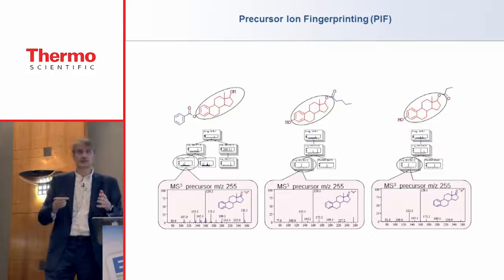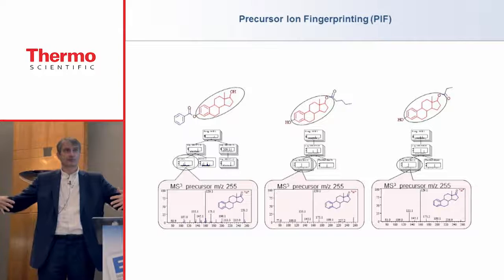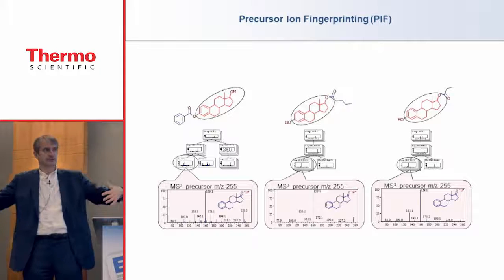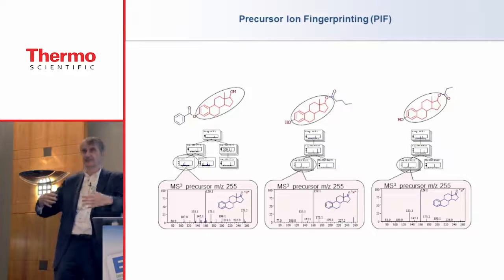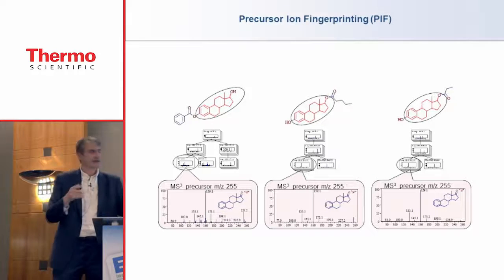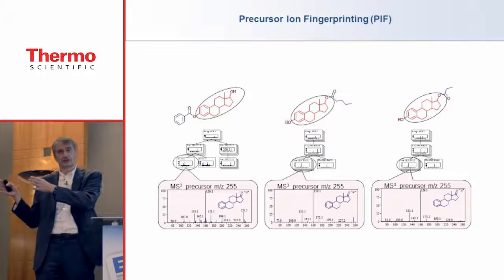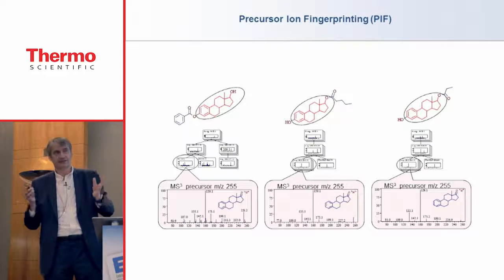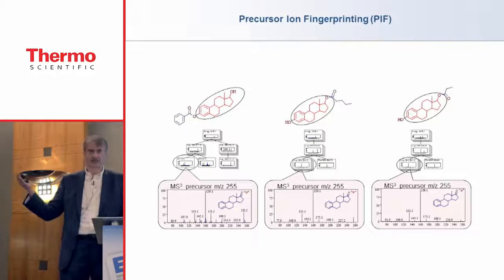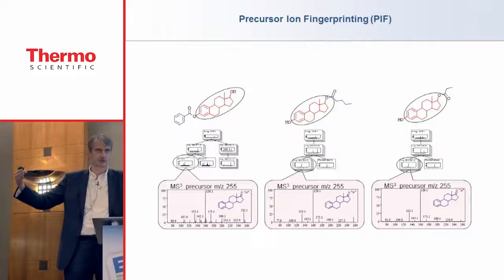And this is the reason why we build very rich spectral trees, because we would like to build a database of substructures. If we cannot identify the structure itself, at least we can do substructures. The advantage of this method compared to other computational techniques you are reading about in scientific papers is that we are not doing some strange mathematics here. We are actually comparing nature against nature. So we are comparing the spectrum of a substructure against the spectrum of a substructure.